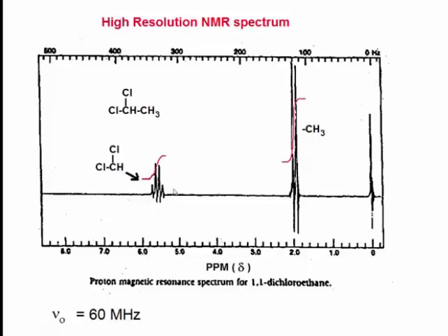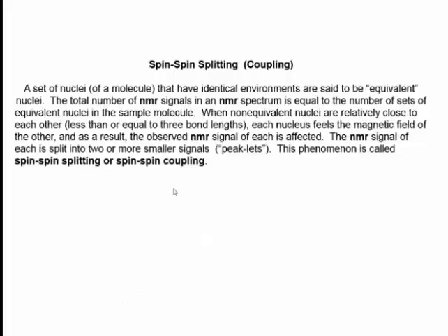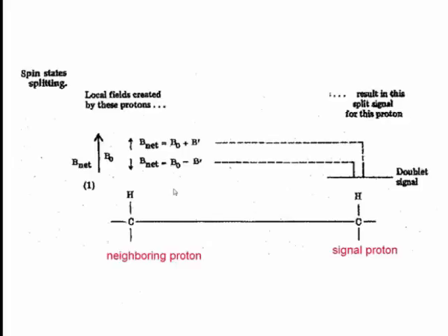Now, let me try to explain from the ground up what's going on here with respect to spin-spin splitting, also called spin-spin coupling. The next slide leaves this diagram to try to understand what's going on.